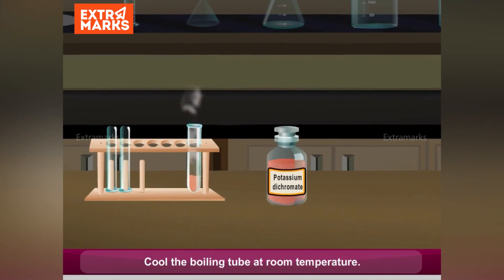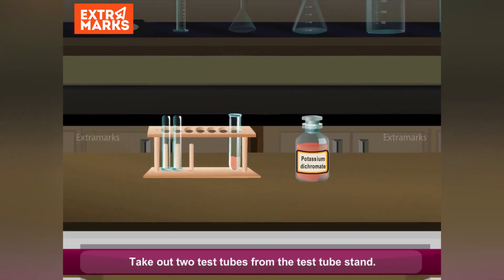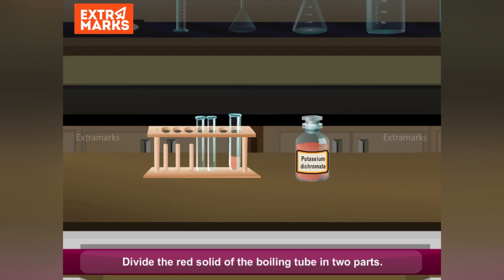Cool the boiling tube at room temperature. Take out two test tubes from the test tube stand. Divide the red solid of the boiling tube into two parts.